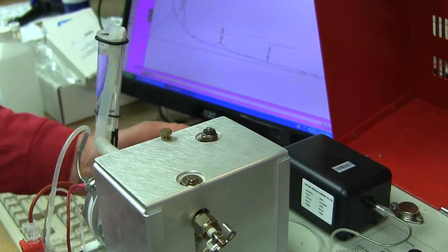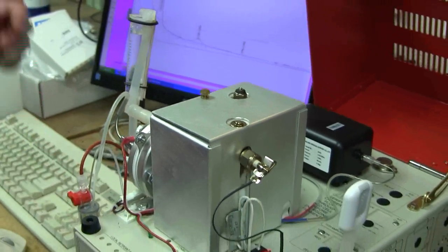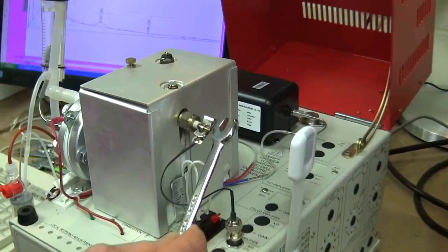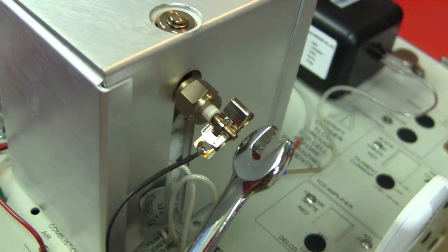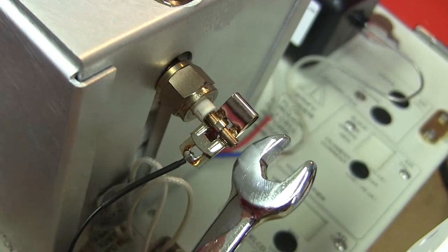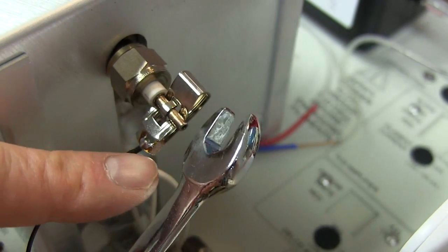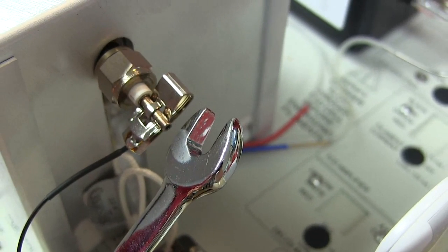And you'll know that it's working because when you turn on the GC, if you've done it correctly, then the flame will light. If you haven't done it correctly, then the flame won't light. So you can see the condensation from the flame is appearing on my shiny wrench, so that means I've got it tight enough.